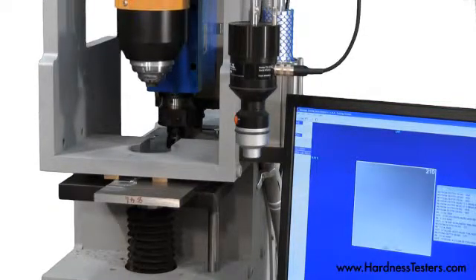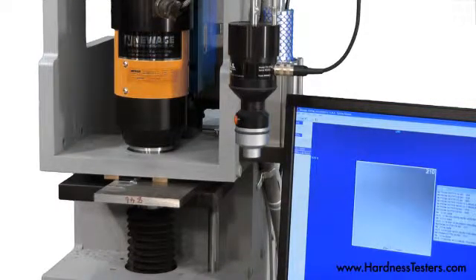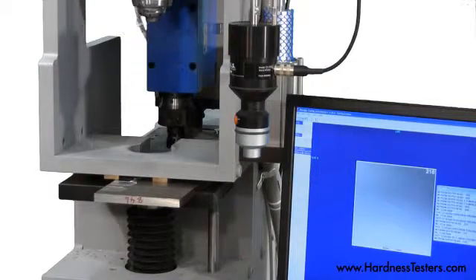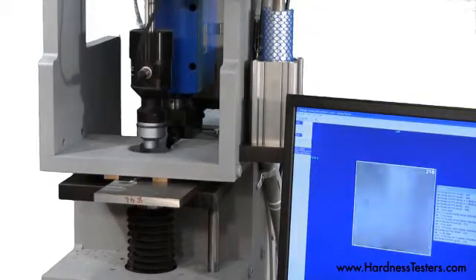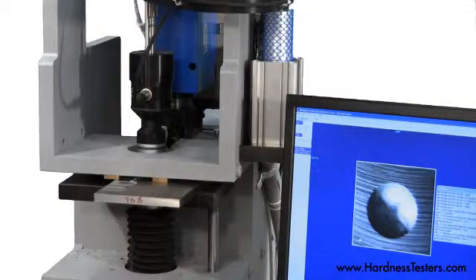After milling, the test head lowers to perform a Brinell indentation. Impressions can be read as per ASTM E103. The integrated BOSS optical read head swings into place to read the Brinell impression as per ASTM E10.